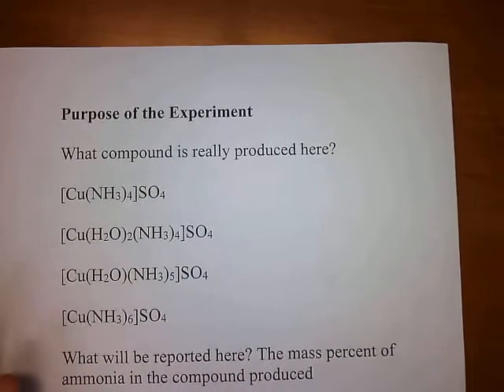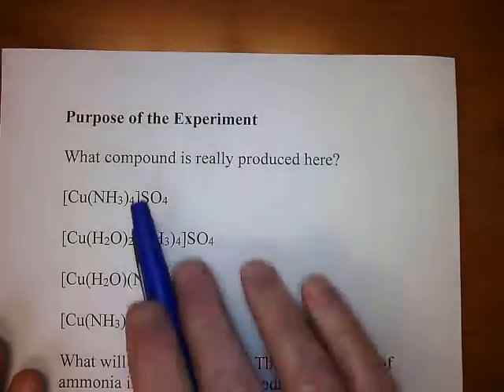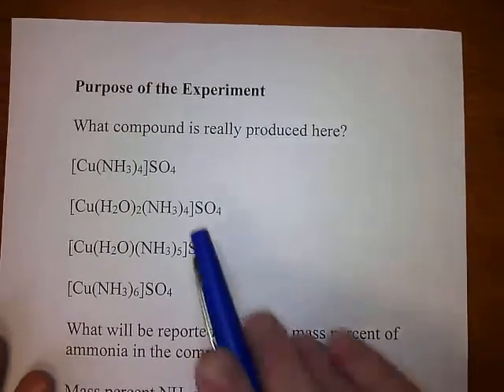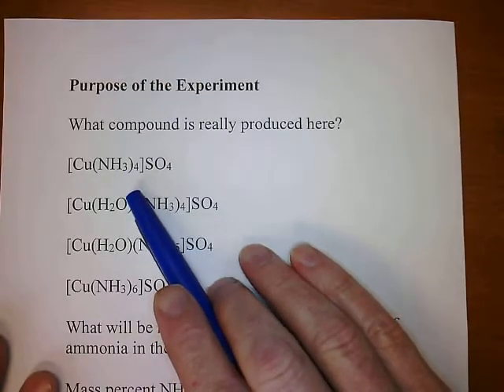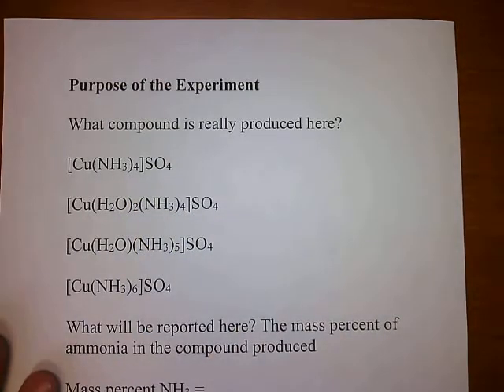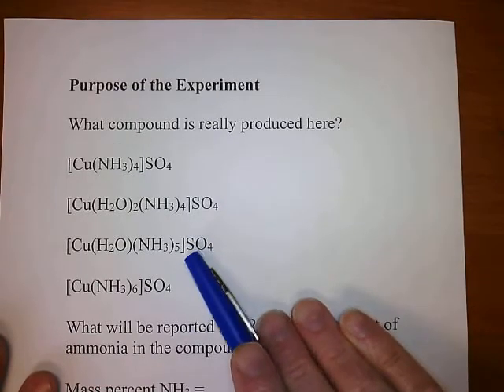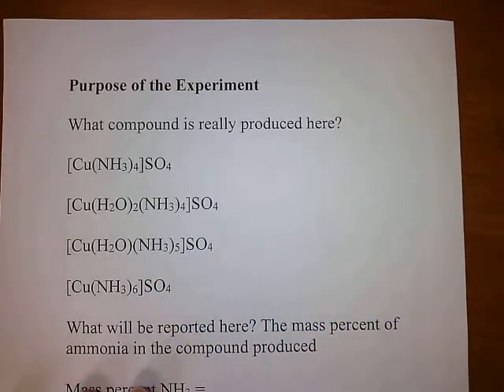So that's the purpose of this experiment. What compound is really being produced here? Are we really getting what we think we're getting? Perhaps we're getting the tetraammine without the two water molecules. Or perhaps we're getting the compound we think. Or perhaps we're getting a pentaammine or maybe even a hexaammine.